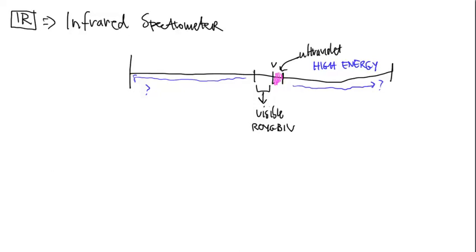And that's where we get the different instrumentation. Each piece of equipment that we will talk about this semester will focus on different parts of the electromagnetic spectrum. So again, if you want to know what this thing is called, electromagnetic spectrum. And this includes everything, all light, not just visible light, but all wavelengths that we know.